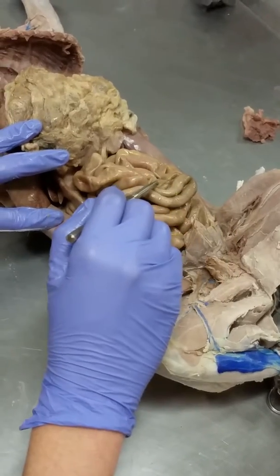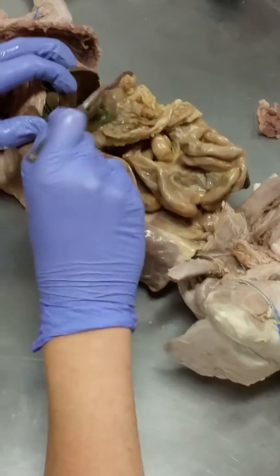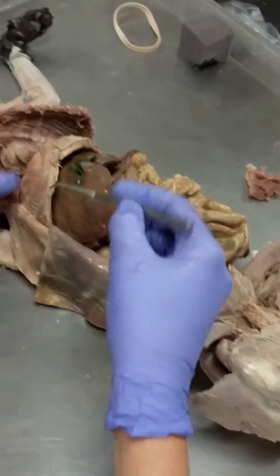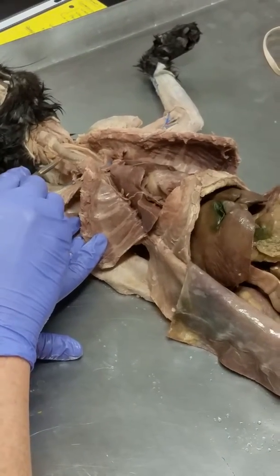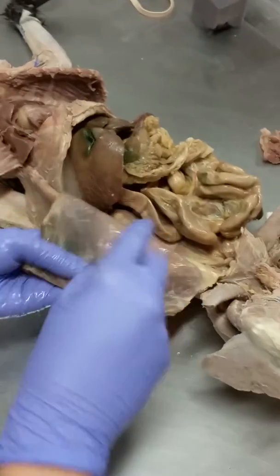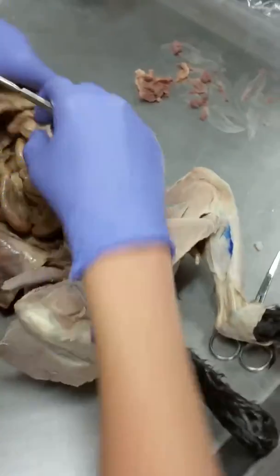Okay, so what's this here? Jejunum. What's this part right here? Duodenum. Stomach. Liver. What's this nerve here? Phrenic nerve. Trachea. Esophagus. What's lining here? Parietal peritoneum.